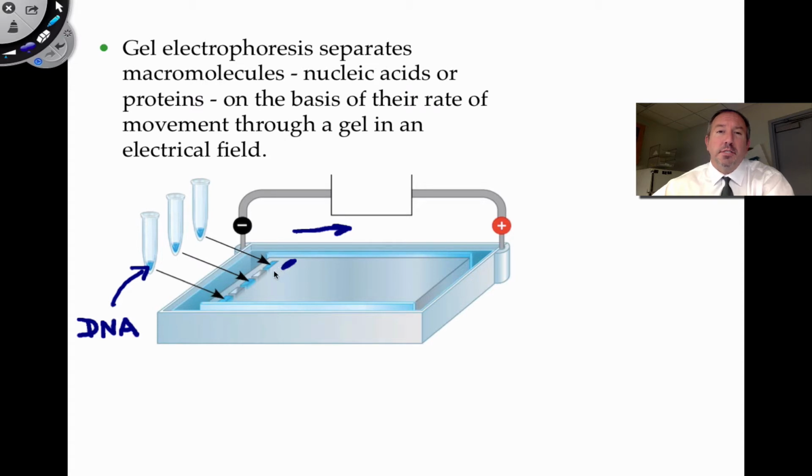So when you're analyzing through electrophoresis, you want to do something with the DNA before you put it into the gel, which is to apply a restriction enzyme, if you're unfamiliar with that, an enzyme that can cut DNA into various smaller fragments. So you would digest the DNA, whether it be a linear piece of DNA or a circular piece of DNA.